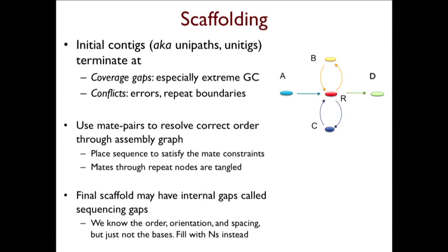So what can we do about repeats? In addition to single end or paired end sequencing, I'm sure it's familiar to everyone in the room, there's this notion of mate pair sequencing, where it's going to be pairs of reads where you know they have some distance between them, even though you don't know the actual sequence that's there. So a common library preparation is to have mate pair libraries on the order of 2 KB, 5 KB, maybe 10 KB or larger. And that's great information in terms of recognizing or reconstructing across repetitive elements.